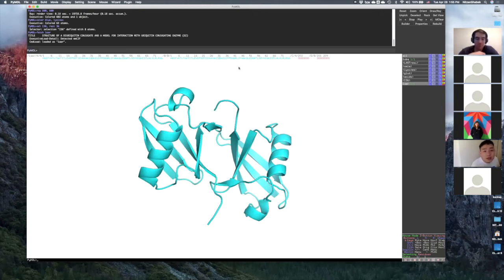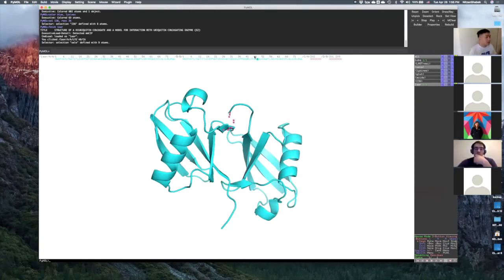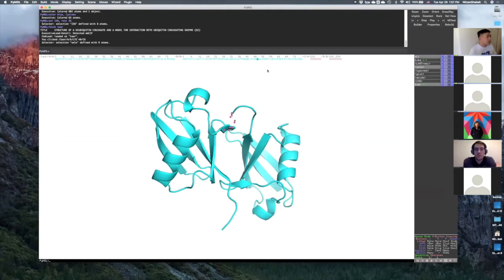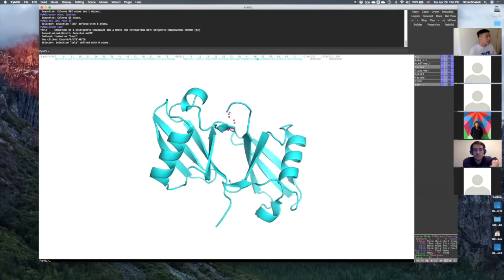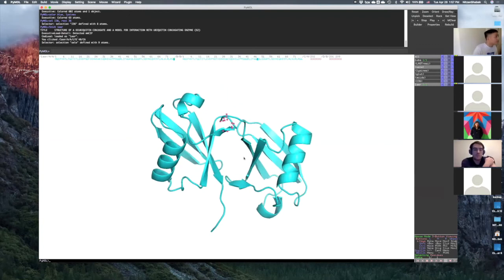Okay, so let's take a look at these two lysine 48. So I'm going to use these in the second chain, okay? So let's keep this one. And now I want you to pick up the glycine 76 of the first ubiquitin, this one. So because we didn't do anything, this is all going to be under select here, S-E-L-E.